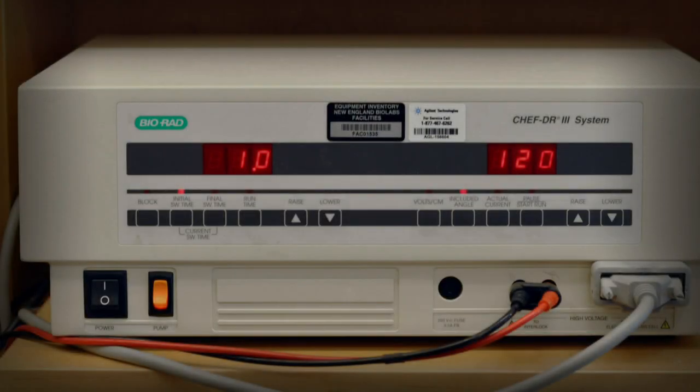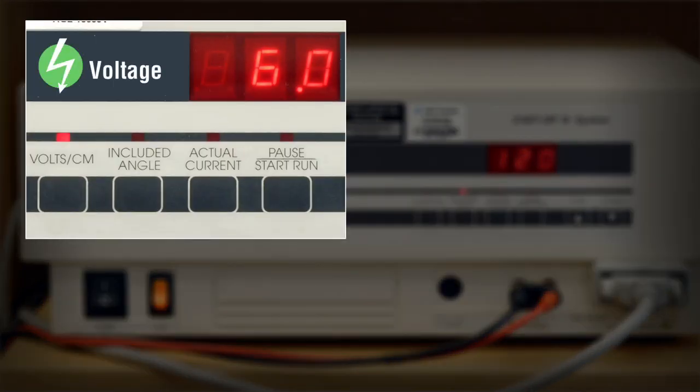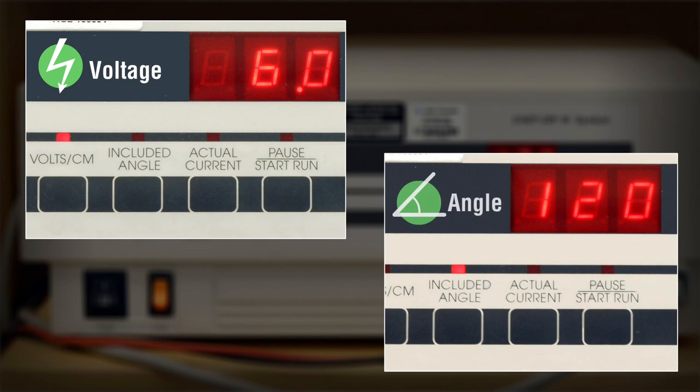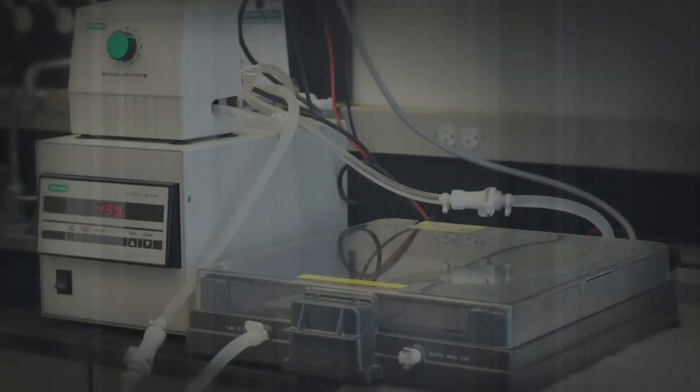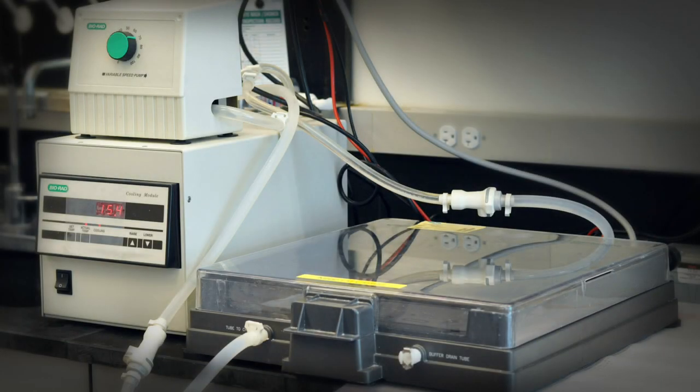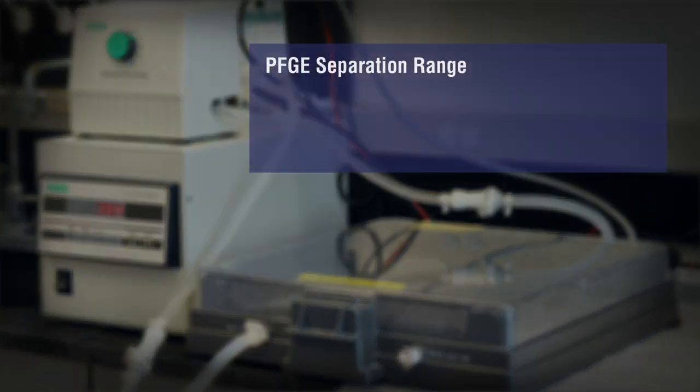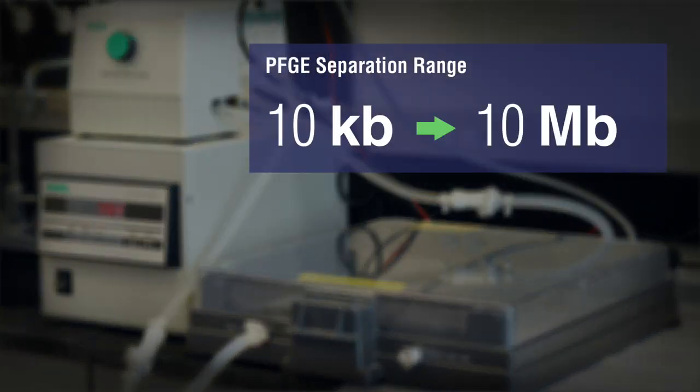Most PFGE protocols are optimized for 6 volts per centimeter gel runs and optimized for a 120 degree angle. With any PFGE system, depending on the migration protocol, you can separate DNA fragments or molecules from 10 kilobases to 10 megabases.